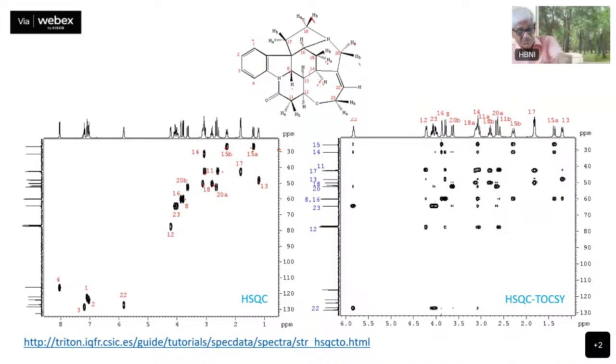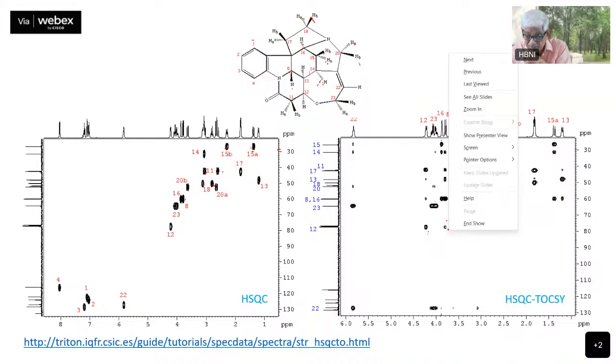So when you determine the structure, this must be consistent with your spectra. All the peaks which are coming must be consistent so that you can confirm the structure of the molecule. So let's look at this one there. This is number 12, right? So the 12 is showing to this one there, 16? No, it can't be 16. Or 8, is it? Where is 12? 12 is here. So 12 is connected to 13, 11. This is 12, isn't it? Yeah. This is connected to this. What is this peak there?